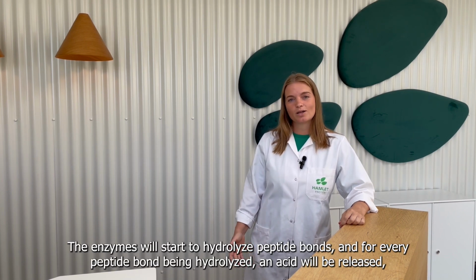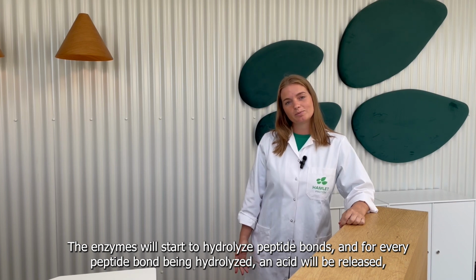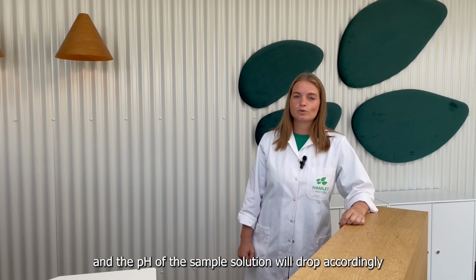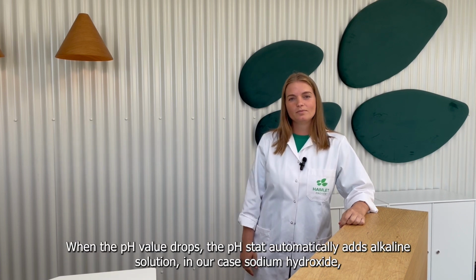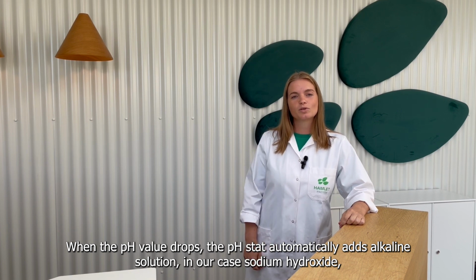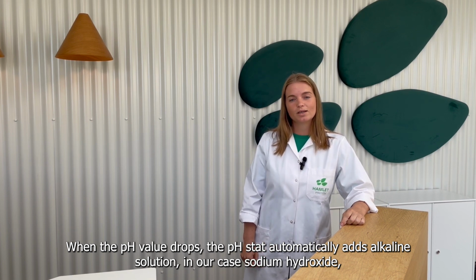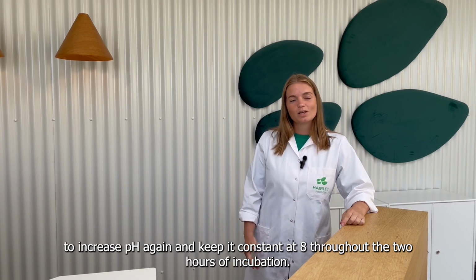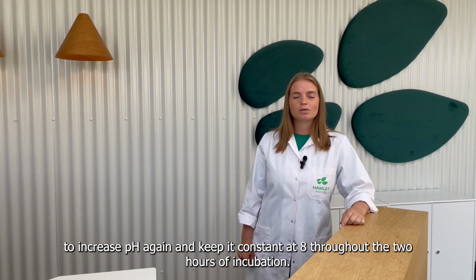Then the enzymes will start to hydrolyze peptides, and for every peptide bond that is being hydrolyzed, an acid will be released, which will force the pH to drop. When the pH value drops, the pH-stat automatically will add the required amount of an alkaline solution, in our case sodium hydroxide, to increase the pH value again and make sure that we are at a stable level of 8 throughout the 2 hours of incubation.